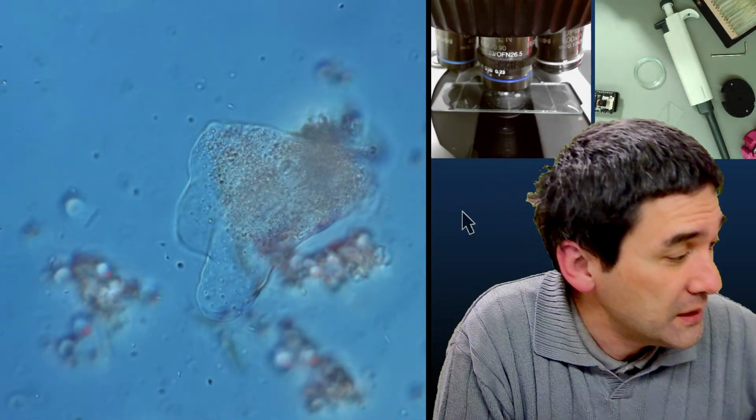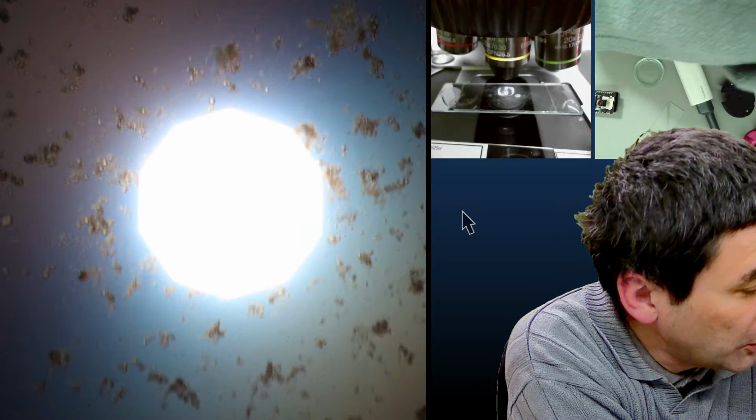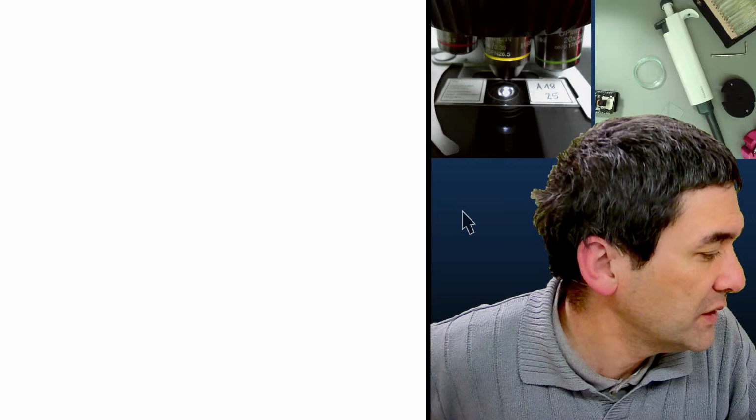Even if it is off topic, but why should it be off topic? It's not off topic. If you're asking something, I'm going to show you. Yes, it is possible to see chromosomes. I have to open the Köhler diaphragm to go down with the intensity.